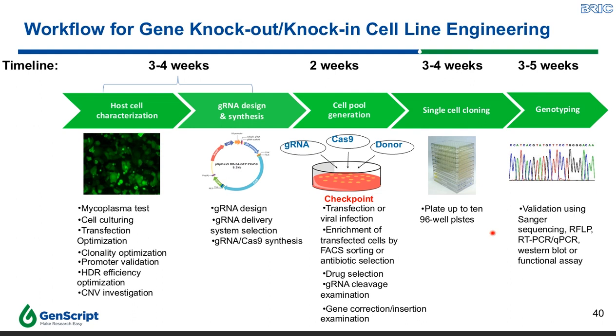This is followed by single cell cloning, and the last phase is genotyping or validation using different methods such as Sanger sequencing, qPCR, Western blot, or functional assay.